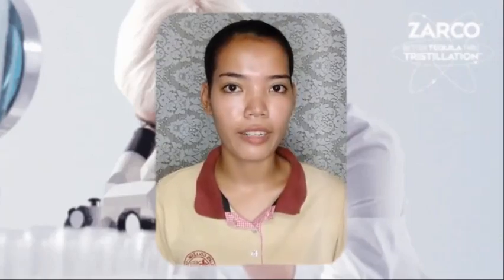Compound microscopes are used to view small samples that cannot be identified with the naked eye. These samples are typically placed on a slide under the microscope. When using a stereo microscope, there is more room under the microscope for larger samples such as rocks or flowers, and slides are not required.